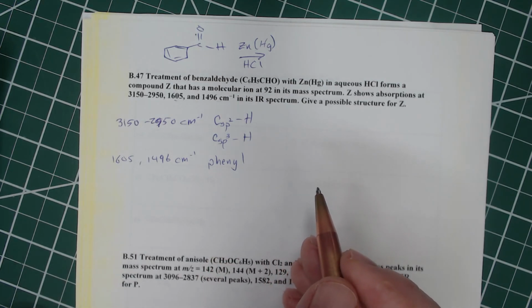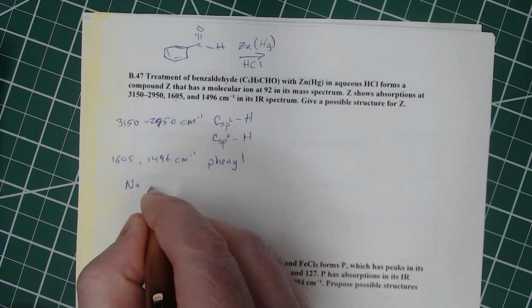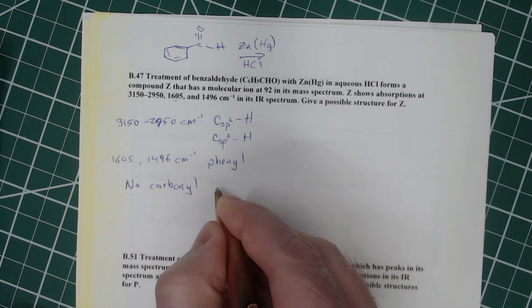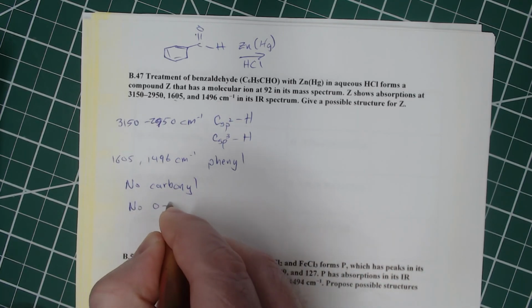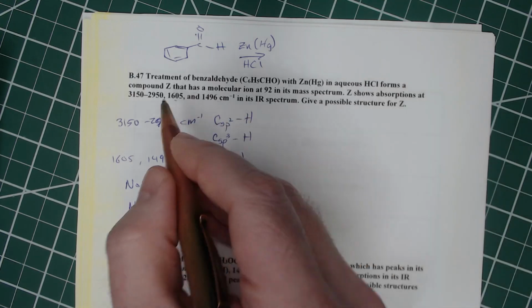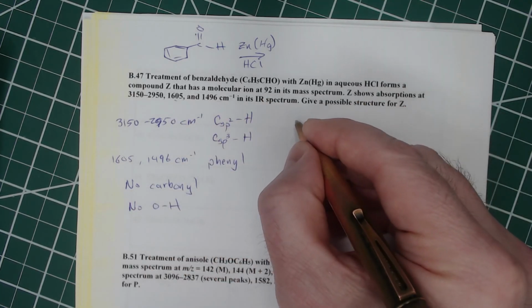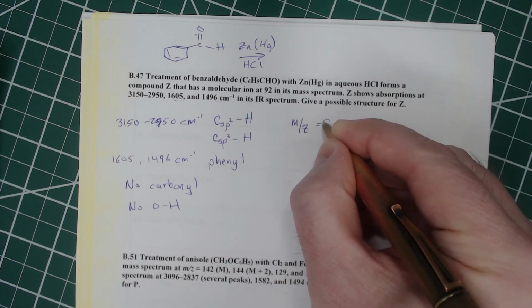So there's no carbonyl. And there's also no OH, so no alcohol present. All right. Our molecular ion is 92, so M over Z is equal to 92.